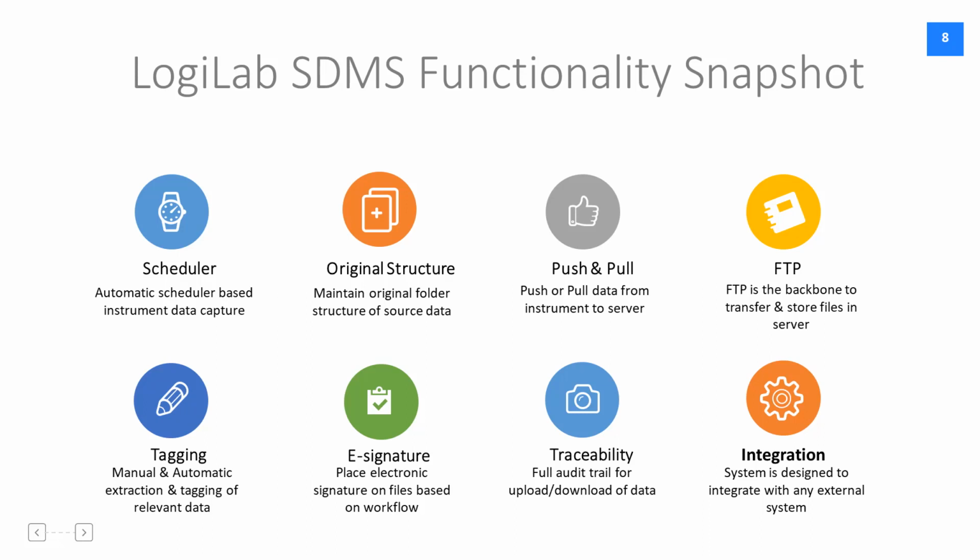Logilab SDMS has full traceability. There is an audit trail module which records each and every event happening with respect to upload of data, download of data, restoring of data. Logilab SDMS has a full-fledged audit trail which is compliant to 21 CFR Part 11.